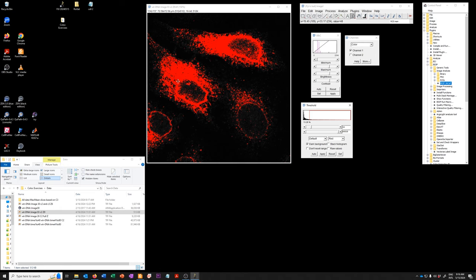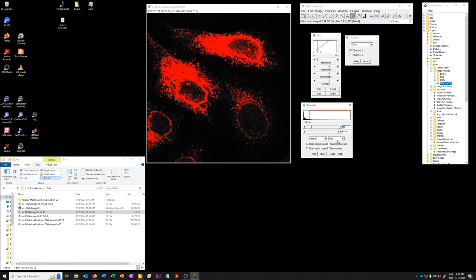So let me explain how this works. When it opens it will use whichever method is set here. This is an automatic global thresholding method to find based on the image and the histogram what the appropriate threshold value is and all the pixels above that value it will show you in red.